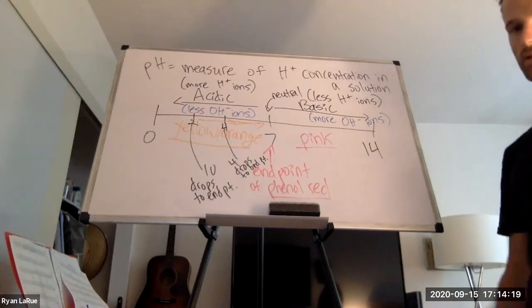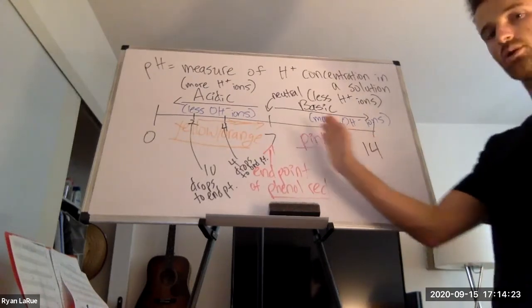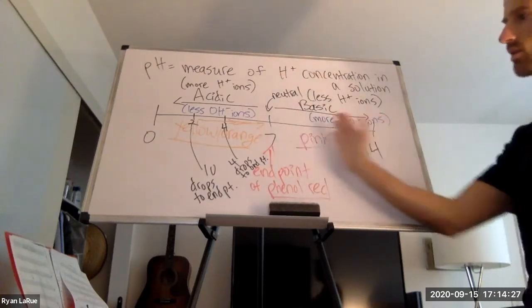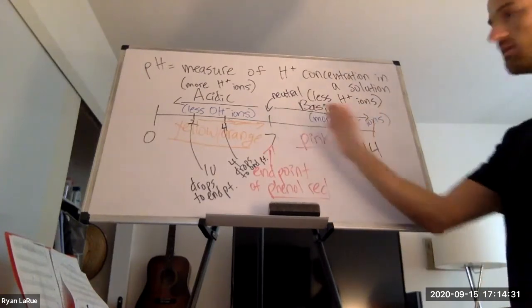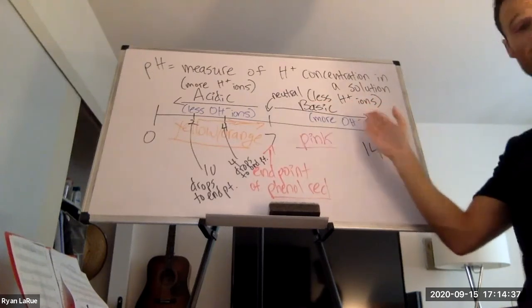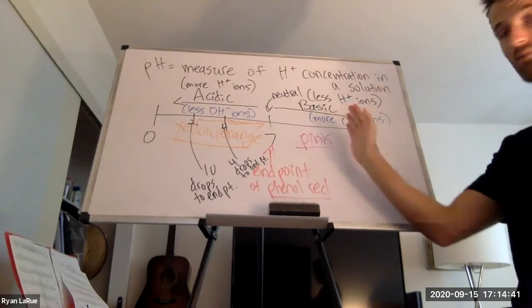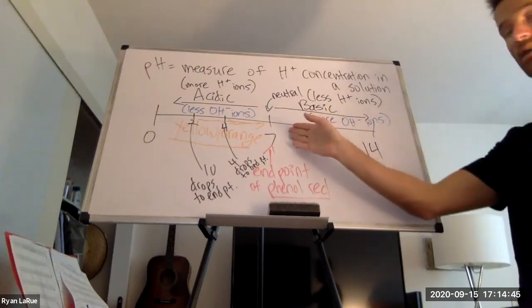Yes, exactly. Acid. You're going to add acid to the base to lower its pH, releasing hydrogen ions, lowering its pH back to 7 to determine the pH of the base. If it takes more acid, then it's a stronger base, right? It has less hydrogens. You have to add more and more to get back to 7 than for a weaker base that has like pH 8.